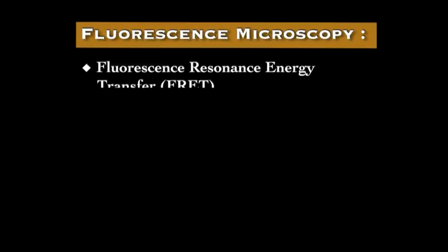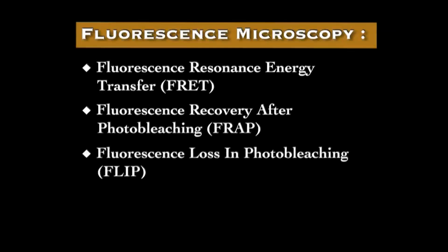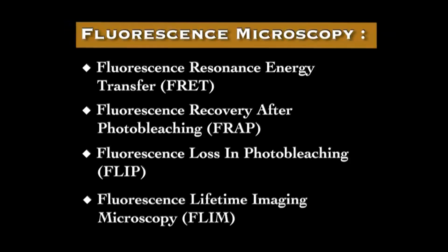Welcome viewers. Today I am going to discuss certain assays in fluorescence microscopy which have revolutionized cell biology. Now I will talk about fluorescence resonance energy transfer or FRET, fluorescence recovery after photobleaching which is FRAP, fluorescence loss in photobleaching which is FLIP, and fluorescence lifetime imaging microscopy which is FLIM.